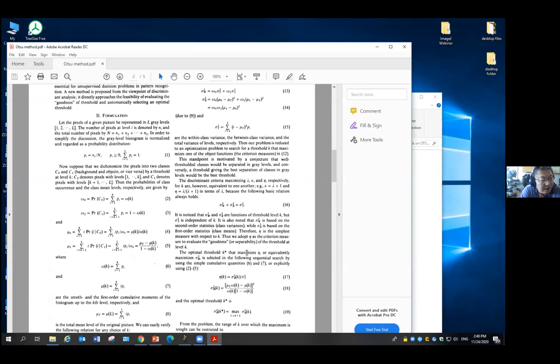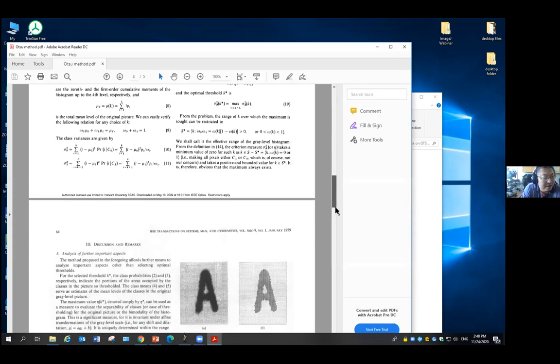I guarantee you don't want to read it. I don't think I read it. I probably read it once, maybe 10 years ago, but I don't want to read it anymore. Really. It's the same with all the mathematics papers and books. One person described all mathematics books very much on the point: all math books are of two kinds. The first kind, you don't want to read after 3 pages. And the second kind, you don't want to read after 3 lines.